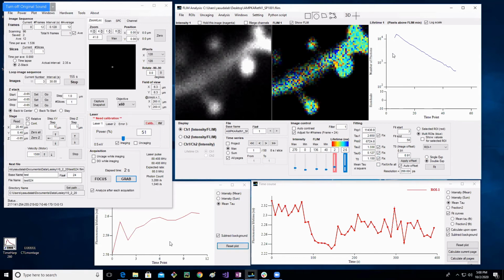They're calculated though from the fit. So they're not a measurement of your system response function. It's a mathematical calculation. And I can show you, in all of our papers, it's published exactly how these values are calculated mathematically. But basically, you should think of these as measurements of system response function, okay? So we're going to fix all those values, okay?